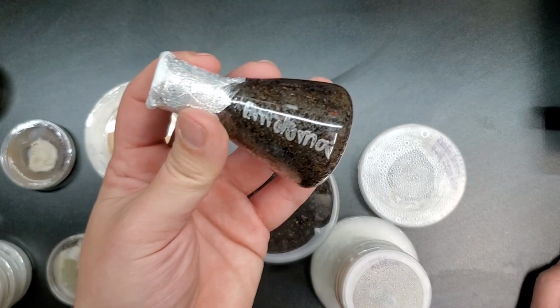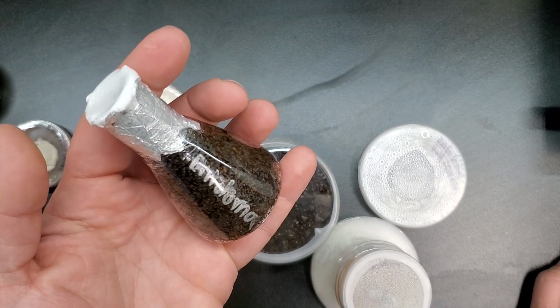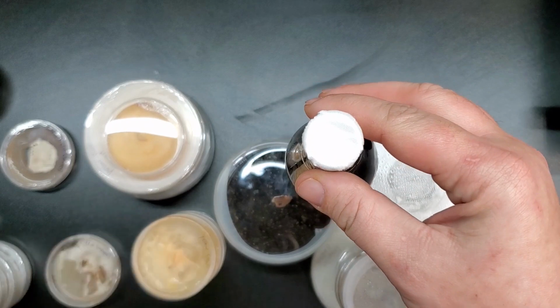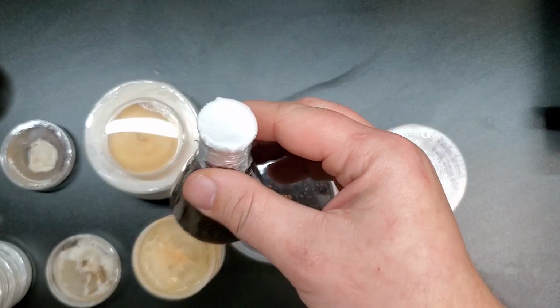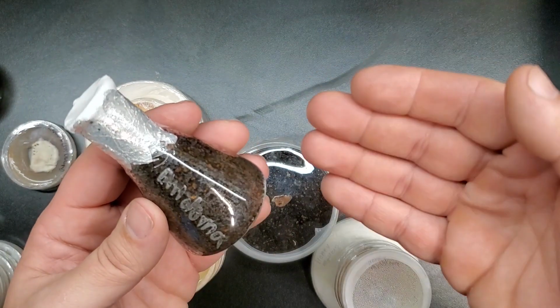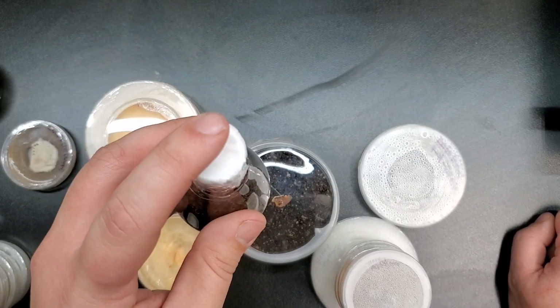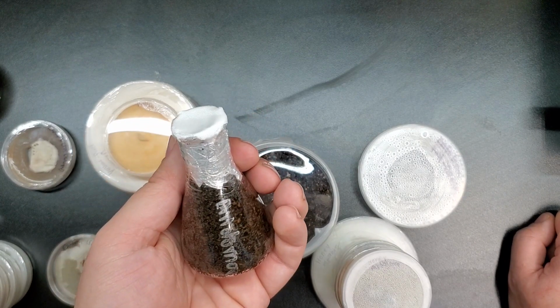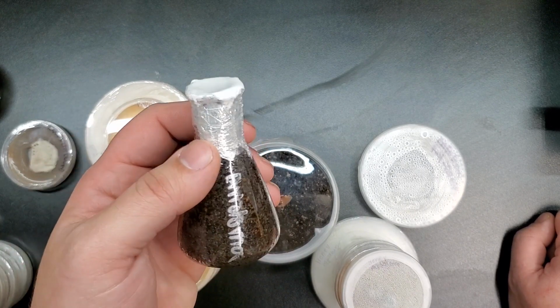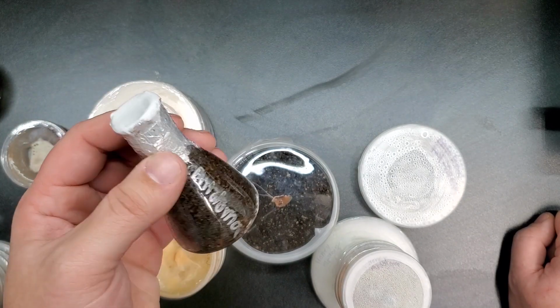These turned out fantastic. And right here is a really small 50 milliliter Erlenmeyer flask that is filled with sawdust and coffee grounds. I inoculated this today at the same time that I did these guys right here. I inoculated this with the Entoloma tissue sample to see what it would look like growing on coffee grounds and wood chips. And after this colonizes completely, I want to open up the top and see if they actually fruit from the top and what form they would fruit in, to see if it's an actual Entoloma fully developed mushroom or if it's like an aborted form of the Entoloma. So this is going to take a while, so I'll let you know what happens to this eventually.